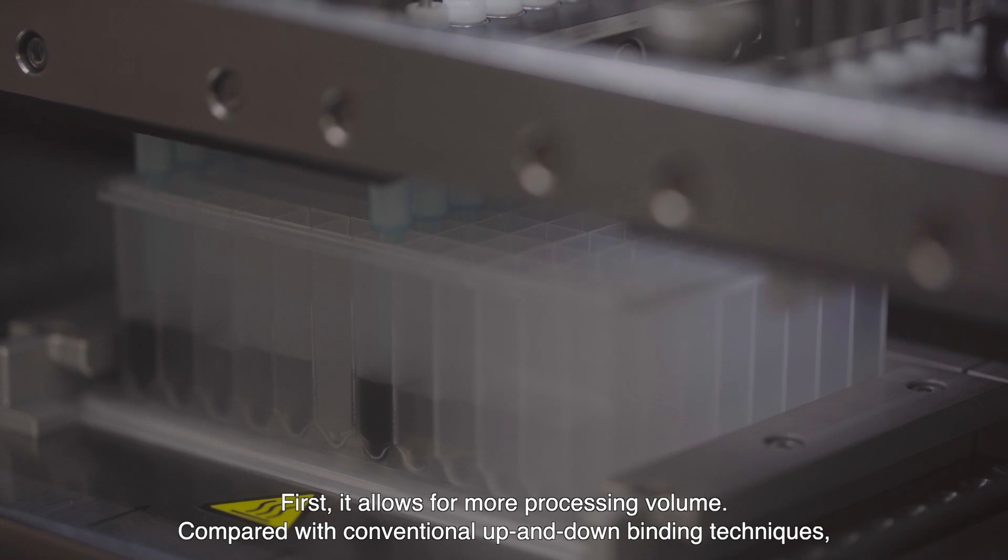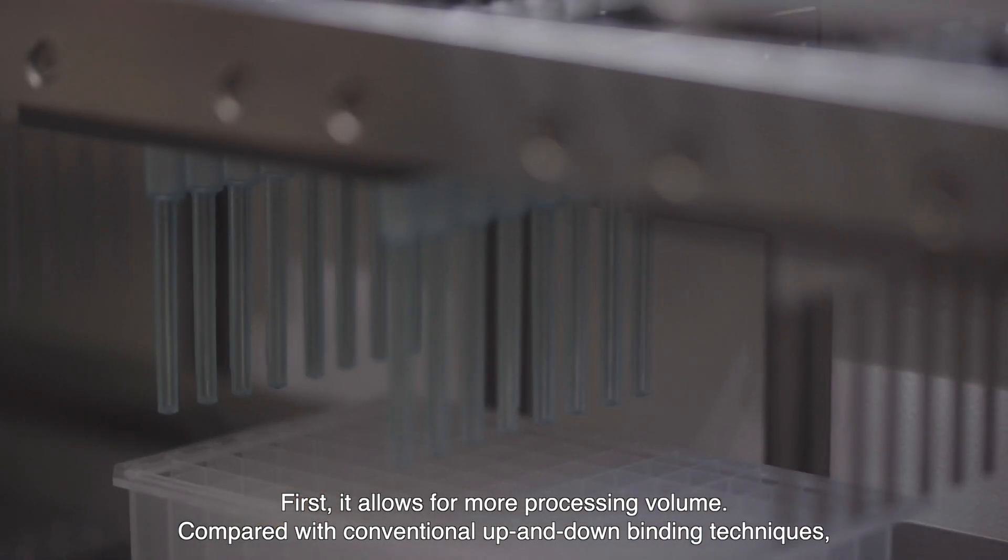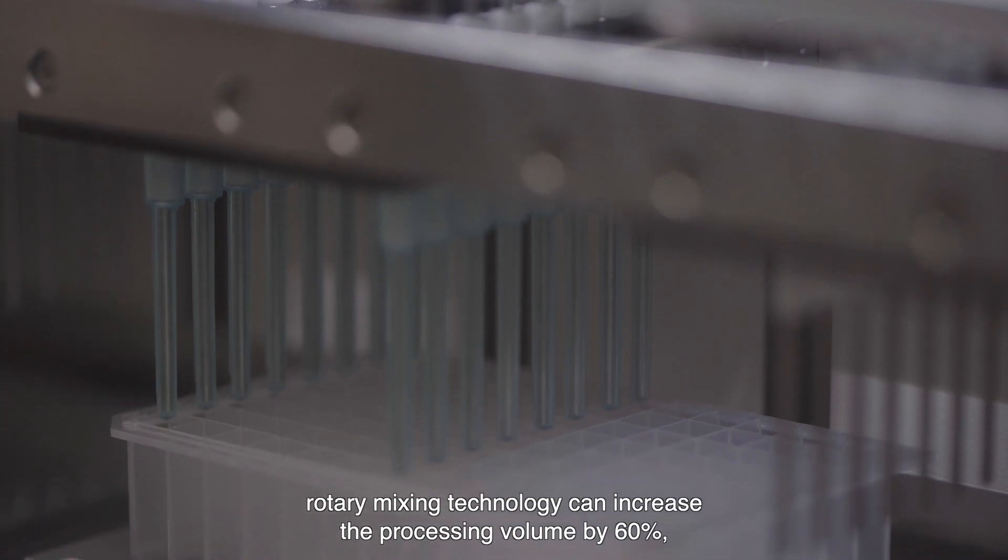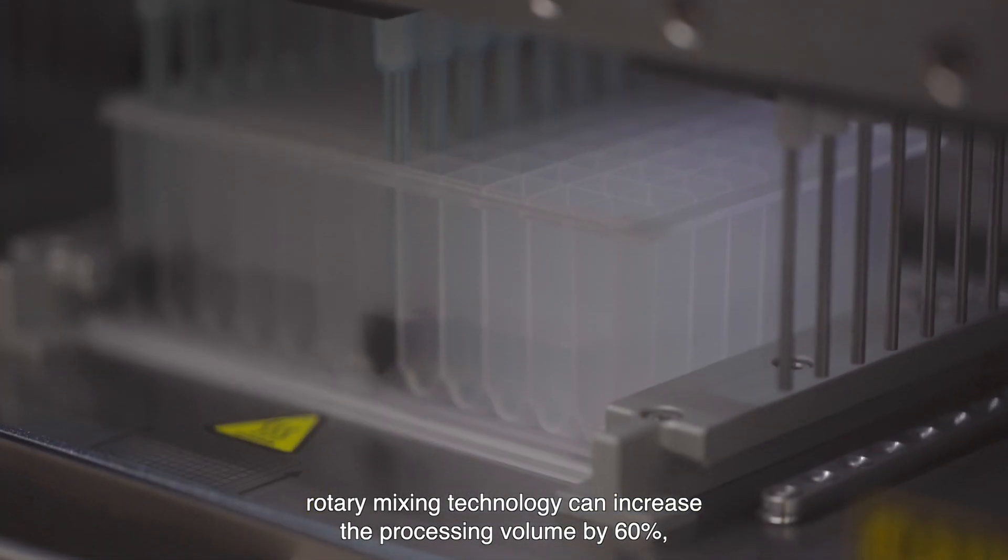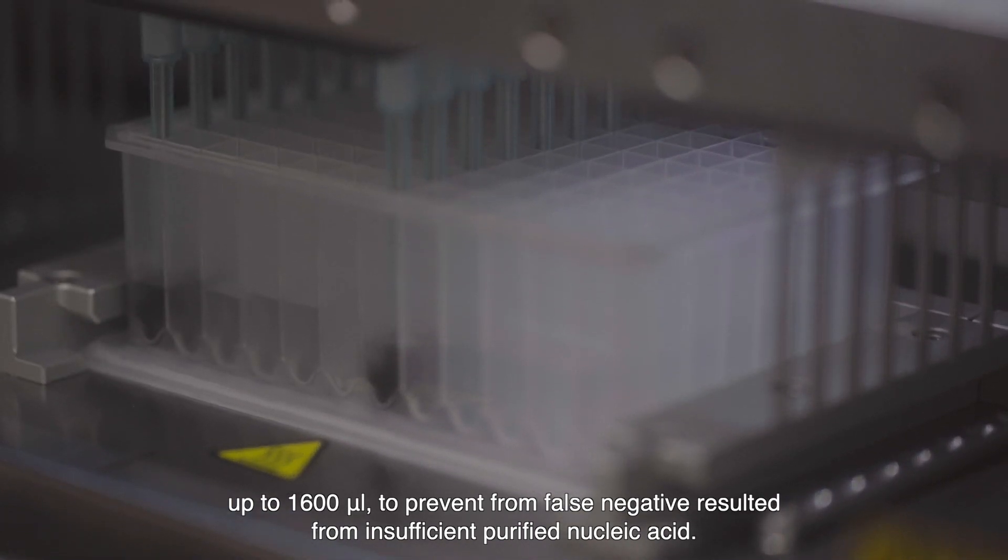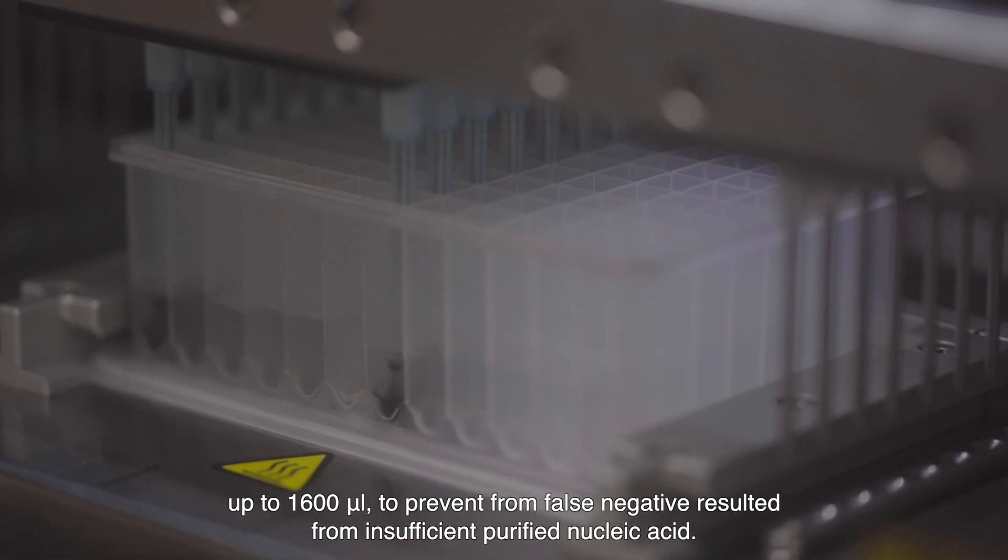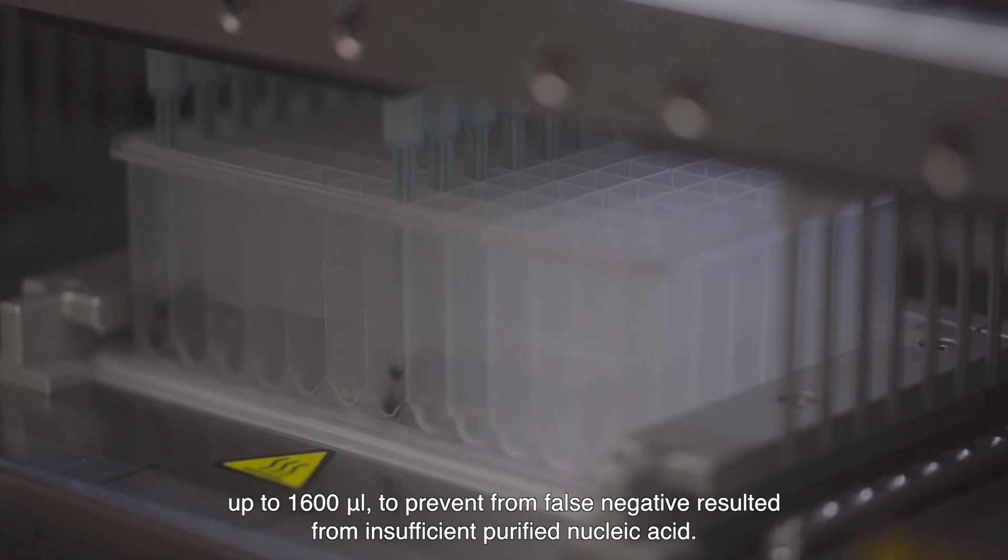First, it allows for more processing volume. Compared with conventional up and down binding techniques, rotary mixing technology can increase the processing volume by 60 percent, up to 1600 microliters, to prevent false negatives resulted from insufficient purified nucleic acid.